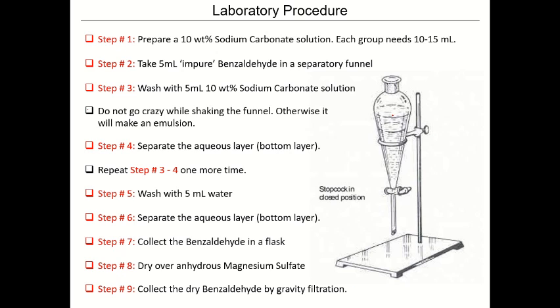Again, you get an aqueous solution, and you mix the benzaldehyde with 5 milliliters of aqueous solution of sodium carbonate 10% in weight, and shake.